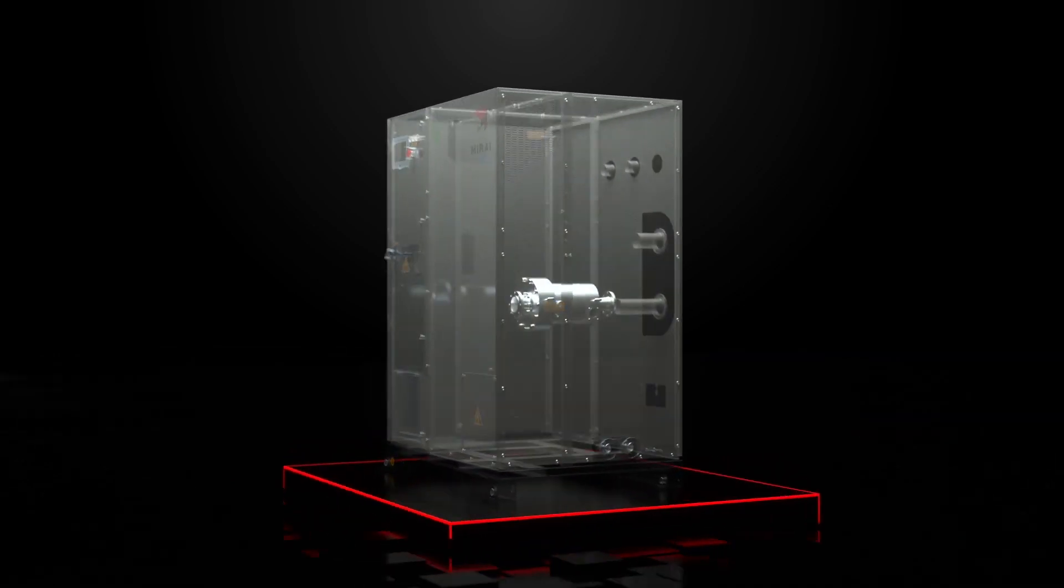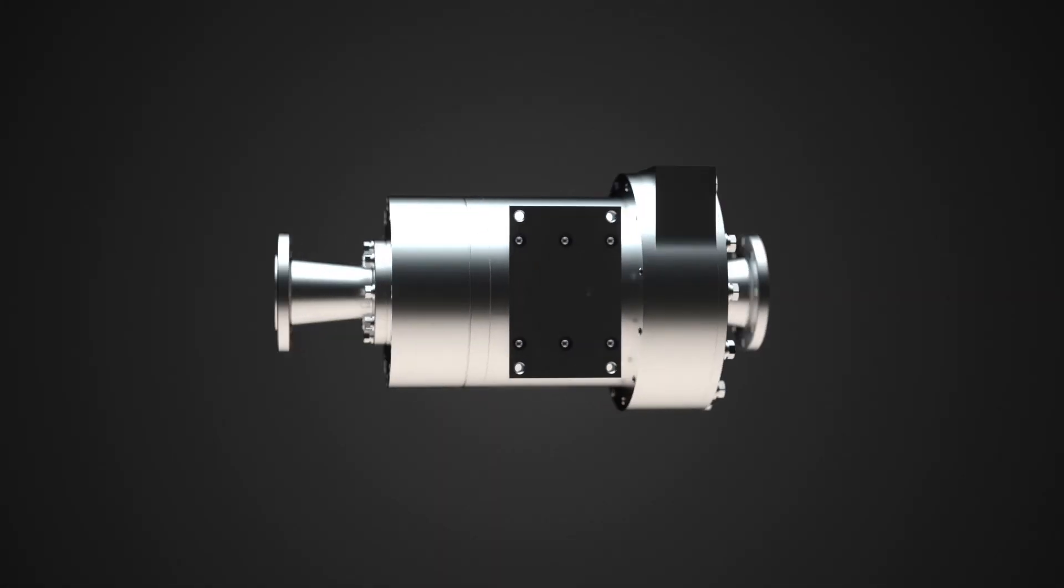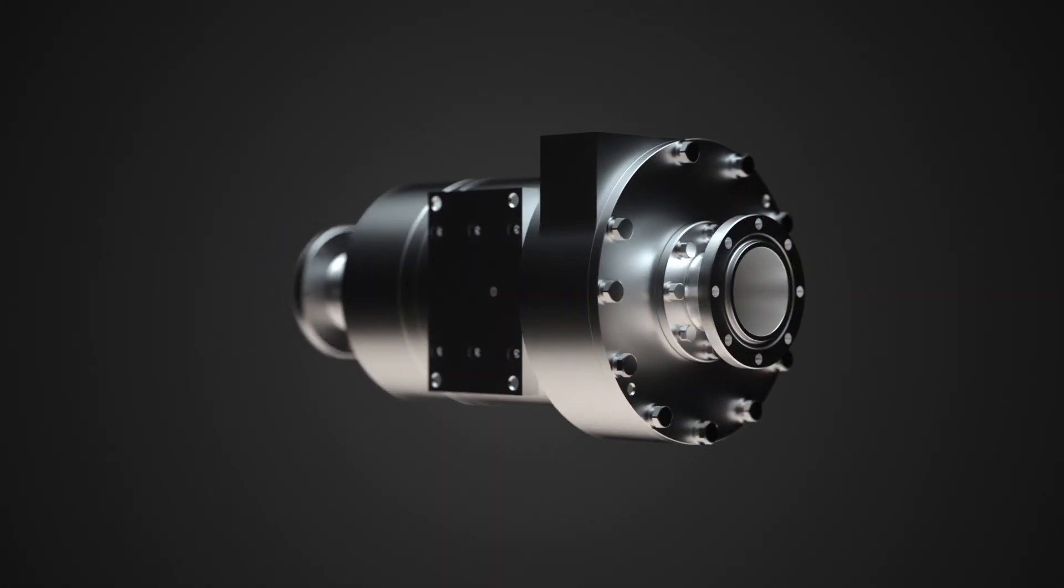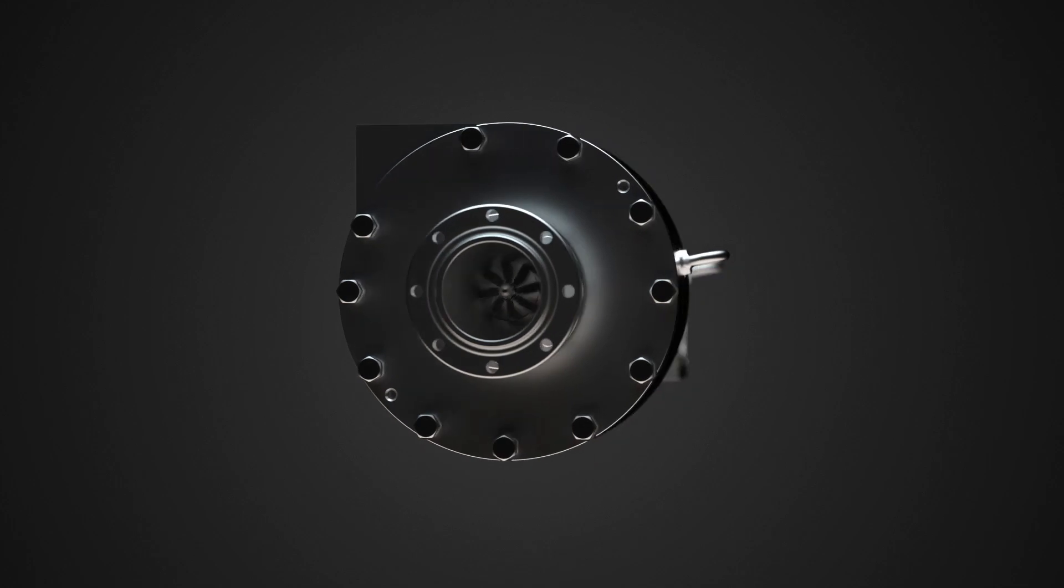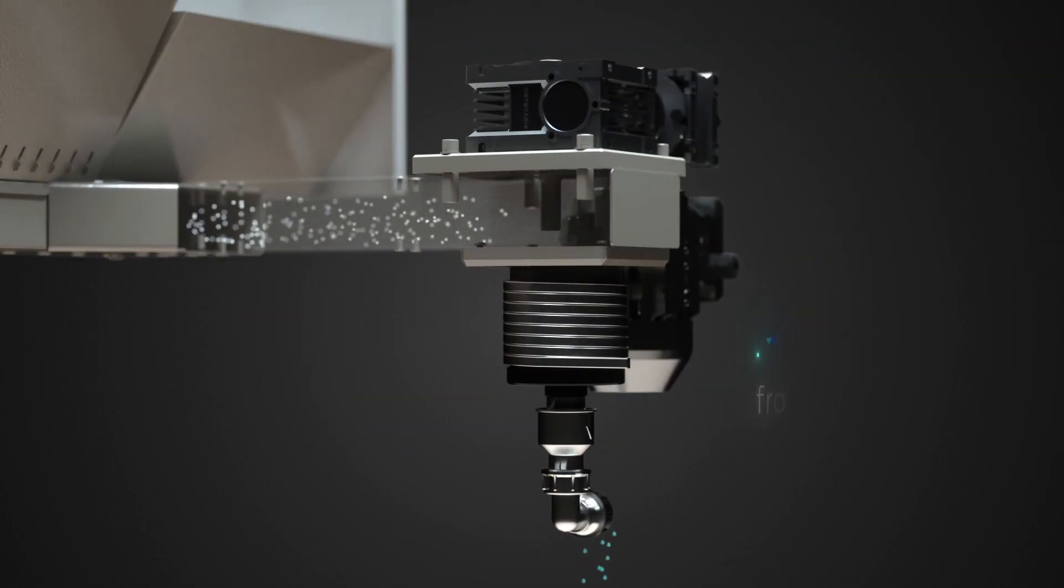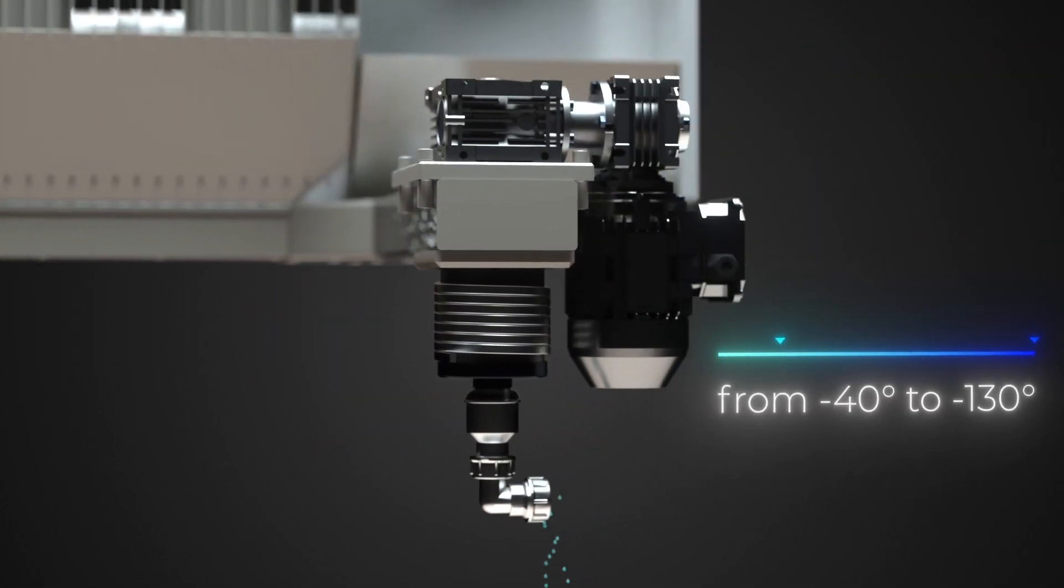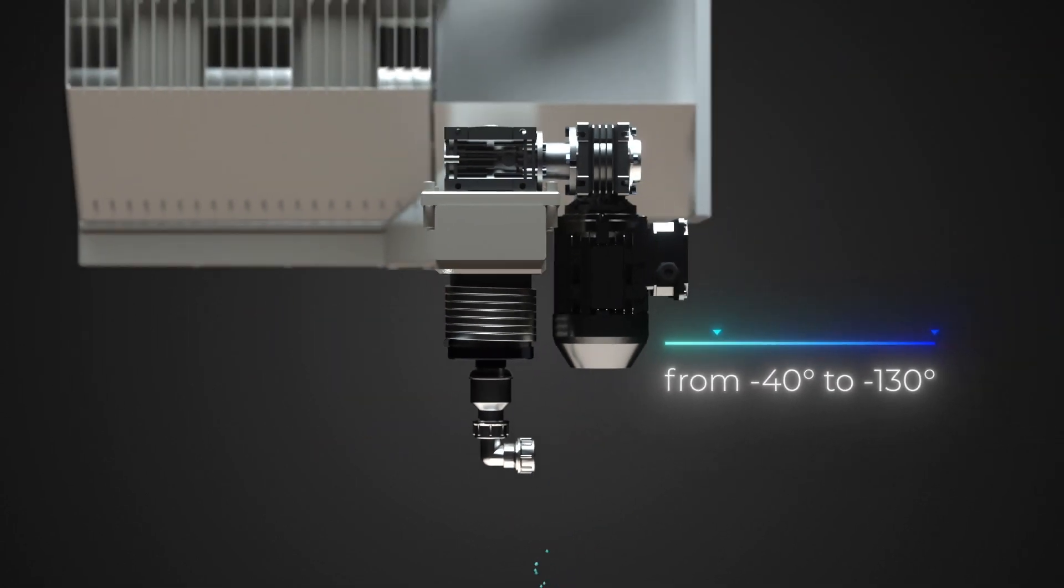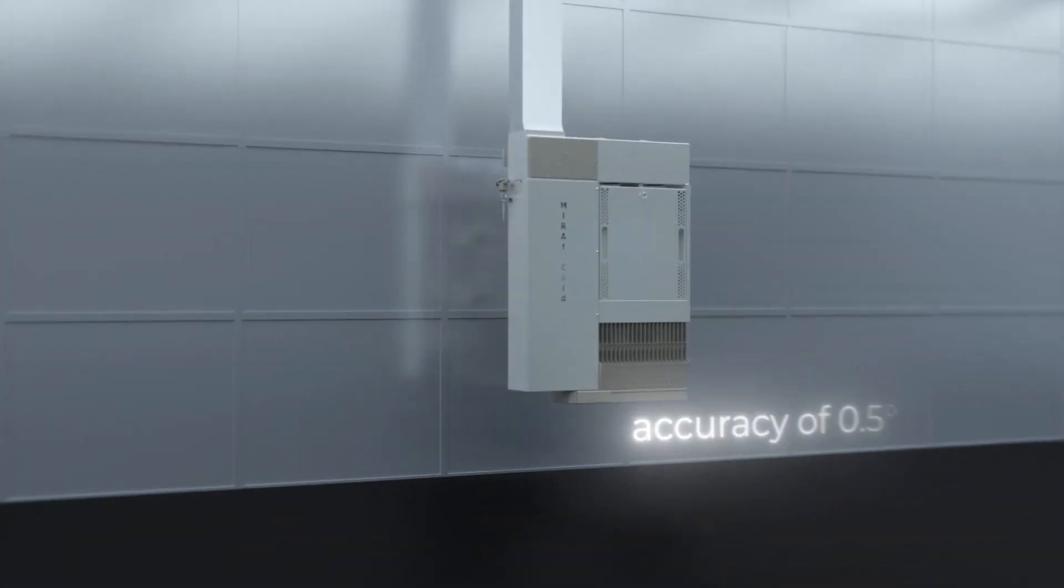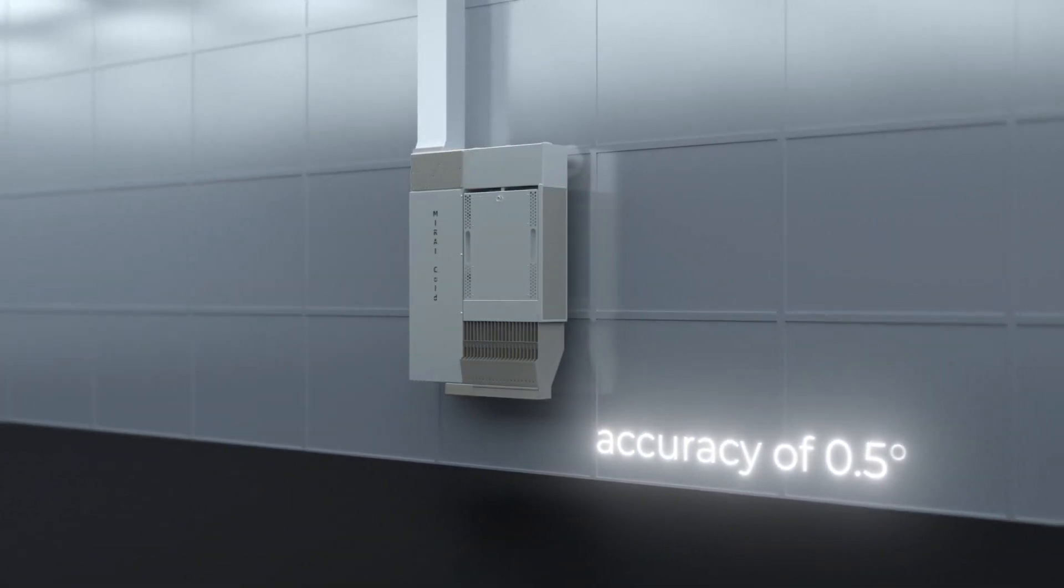Its advanced technology of the humidity extraction device makes you forever forget about the need for defrosting and ensures stable operation in the range from minus 40 to minus 130 with an ultimate accuracy of 0.5 degrees.